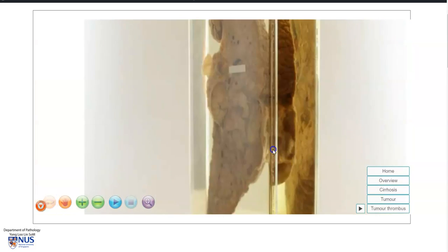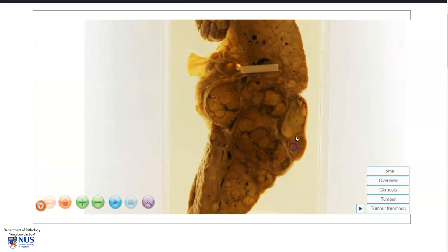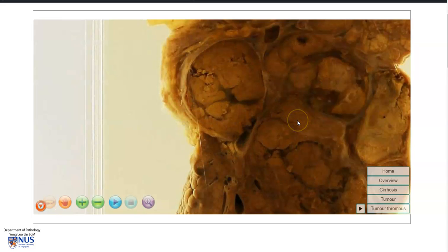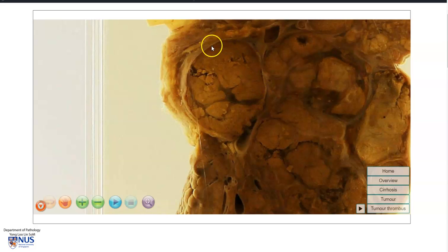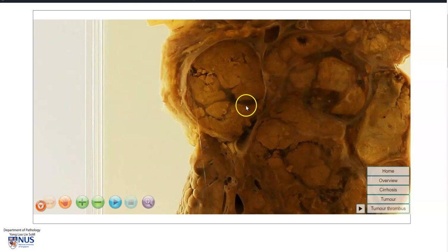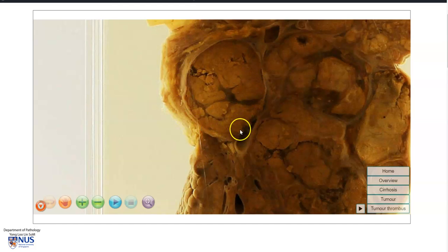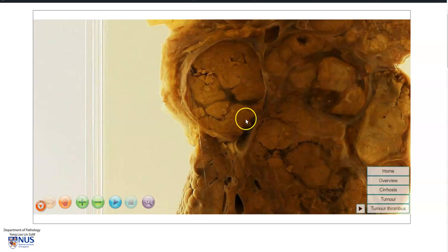Turning this around, we can see an interesting feature here — this rounded nodule within a vascular structure, and this is actually the tumor nodule within the portal vein. So there is tumor thrombus involving the portal vein.